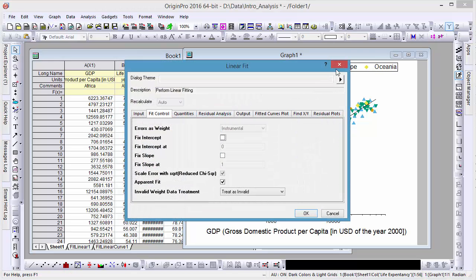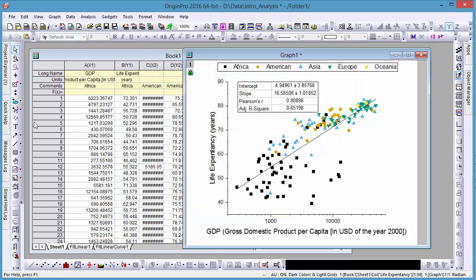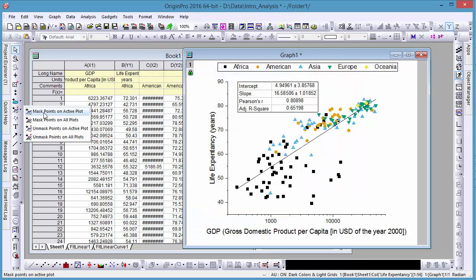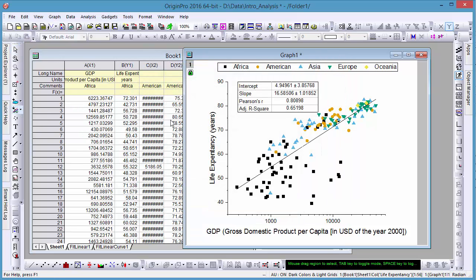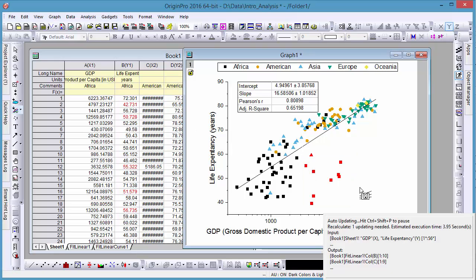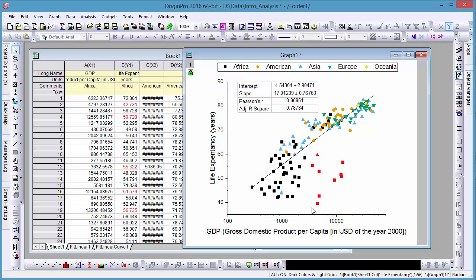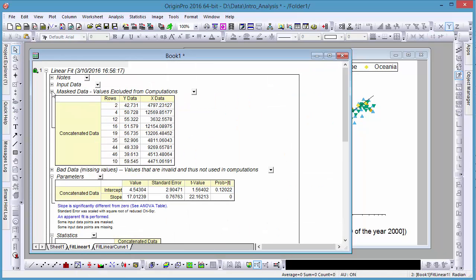If you have outlying data points that you would like to remove from the analysis, you can use the mask tool to remove them from the fit in calculations, and the resulting line will update automatically. We can hide these masked points in the graph window. All masked points are listed in the masked data table in the result sheet.